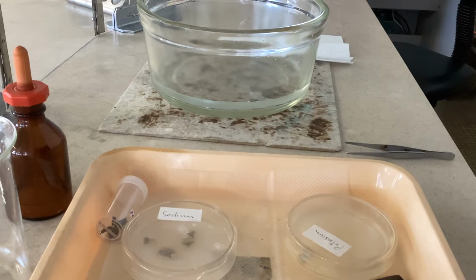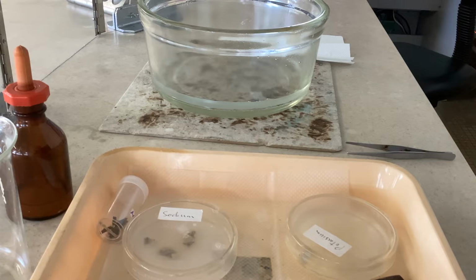This paraffin oil is different from vegetable oil or animal fat. It is made from petroleum. And the reason why they are stored like this is because sodium and potassium are very reactive. And this layer of paraffin oil can avoid the contact of them with oxygen and water in the atmosphere to avoid oxidation.